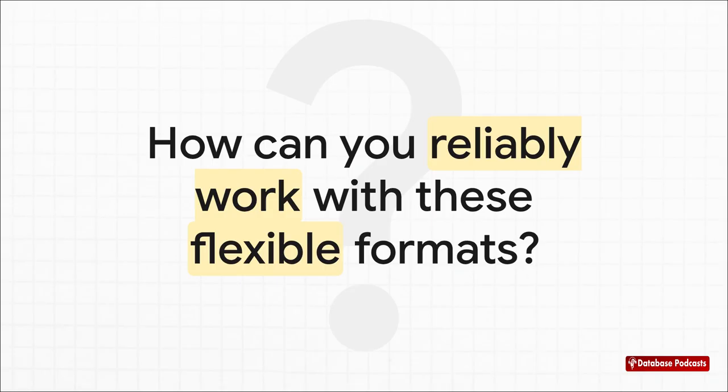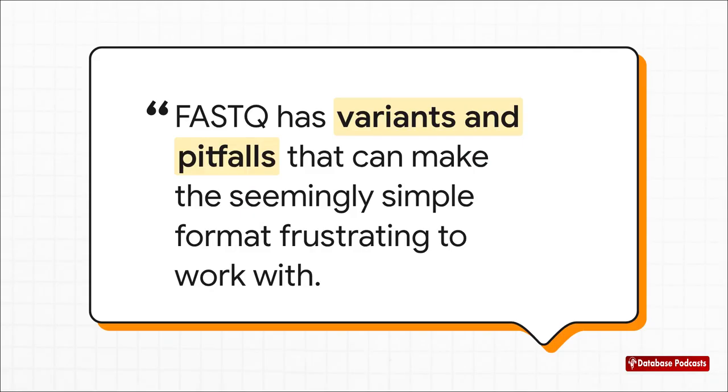So this brings us back to a really practical challenge. For anyone who's used to the rigid, predictable structure of a SQL database table, these formats can feel a little loose, a bit chaotic. So how do you do a really simple task, like just counting how many sequences are in a massive file without having to write a custom, error-prone parser? This quote just gets right to the heart of the problem. The ad hoc nature of these formats is both their greatest strength and their greatest weakness. Their flexibility is what makes them so universal, but it also means you can't just assume a clean, predictable structure. You need robust methods to handle all the potential inconsistencies.